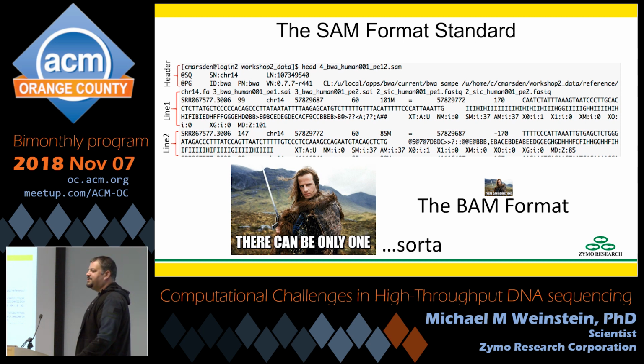I say sort of here because a lot of times people who get back DNA sequence will actually get something called the BAM format. BAM format is just a binary compressed version of the SAM format. That's really all it is. There's no information gained or lost. It's just compressed. It's also indexed, so you get a second file, usually your BAM index. But basically, SAM files, easy for humans to read. BAM files, easy for computers to read. There is no loss or gain of information between them. It's just who can read it more easily.